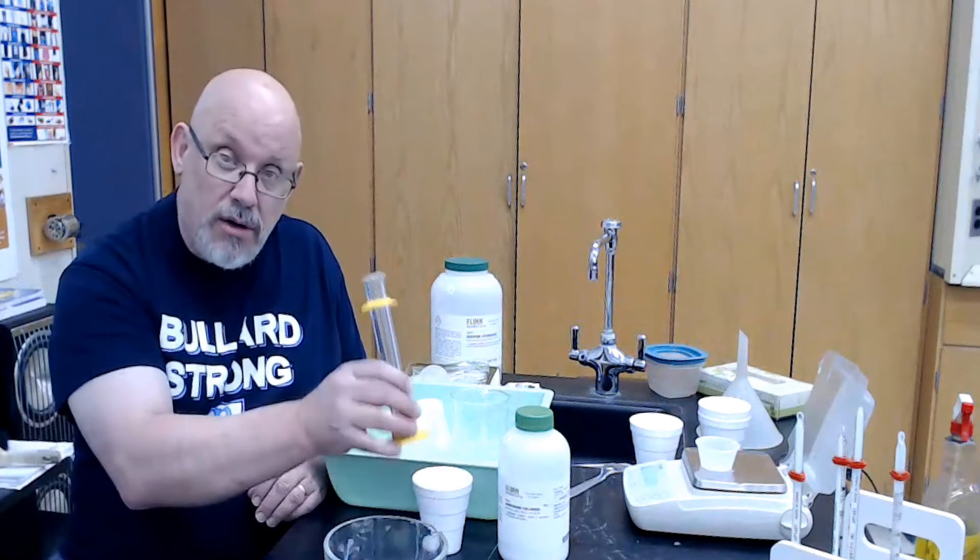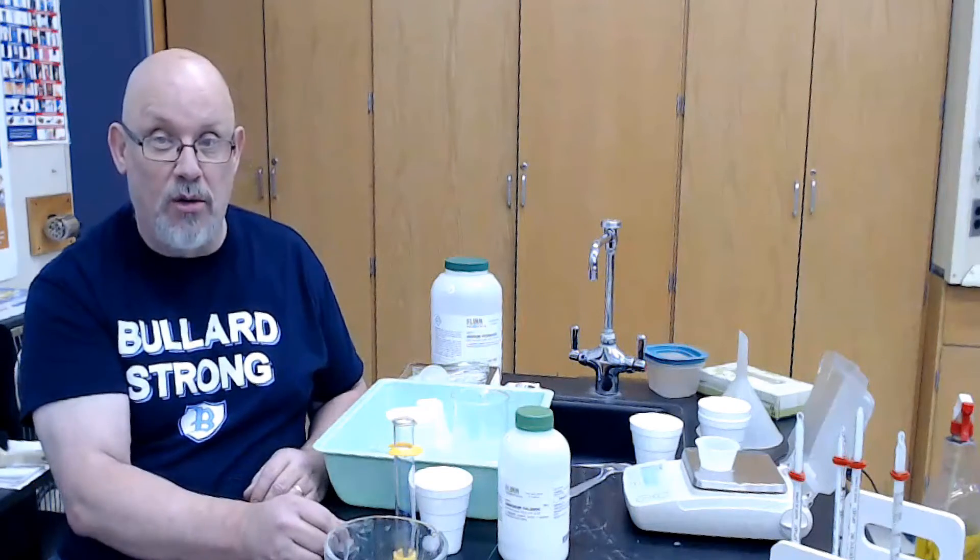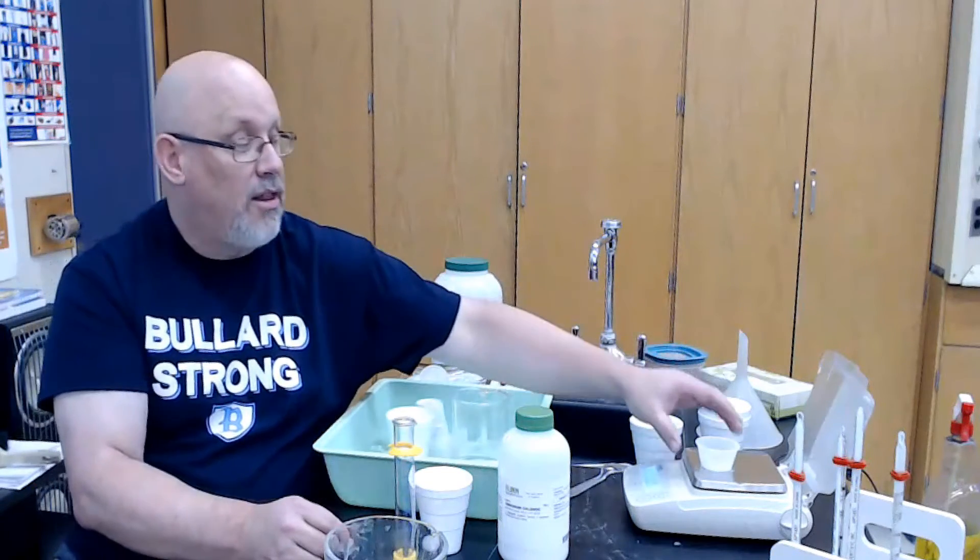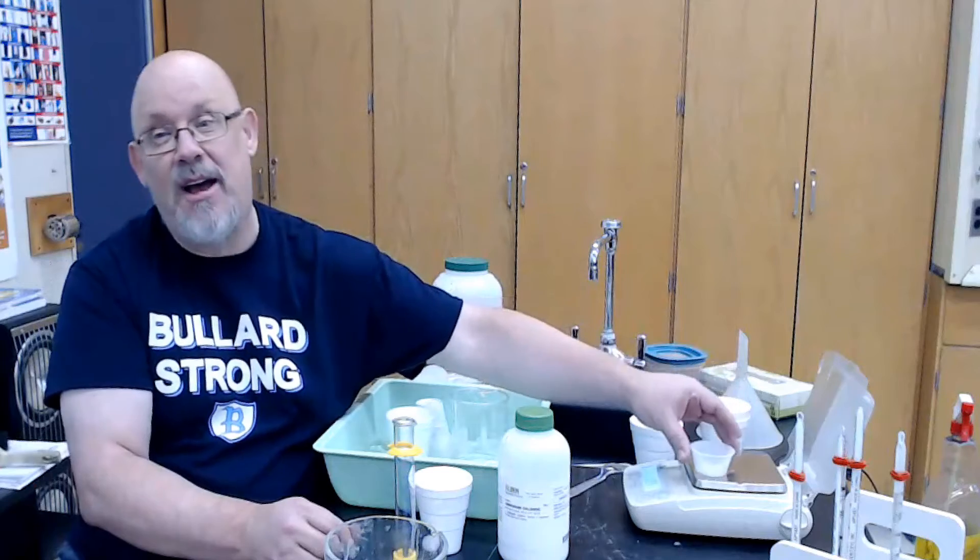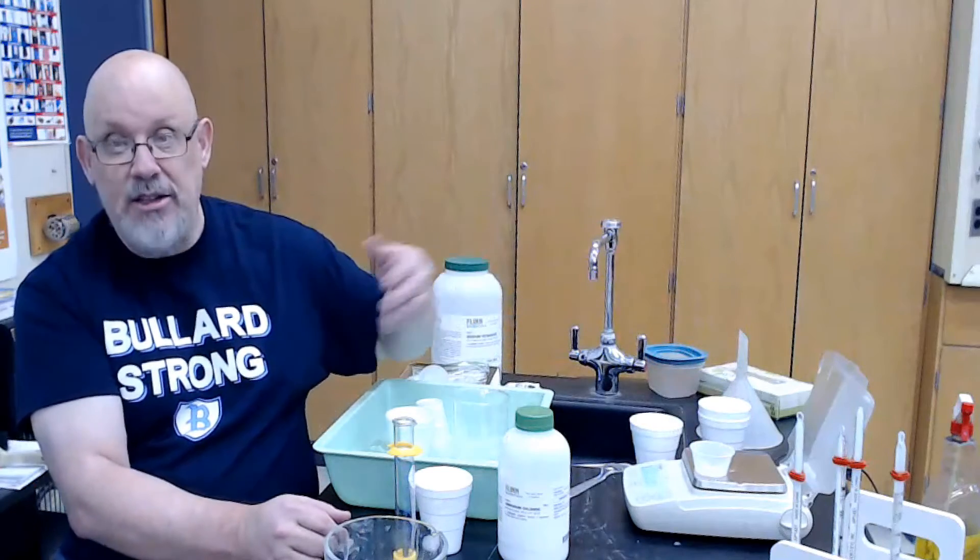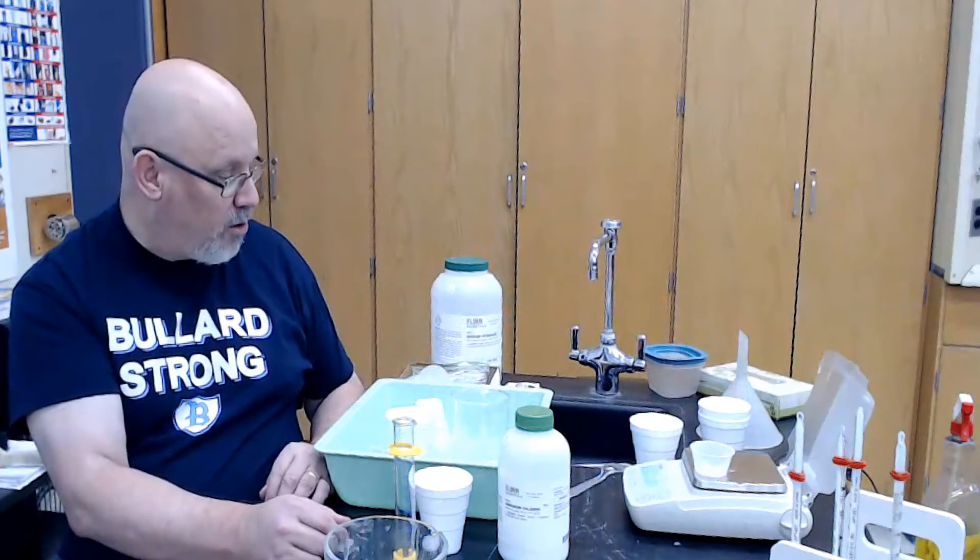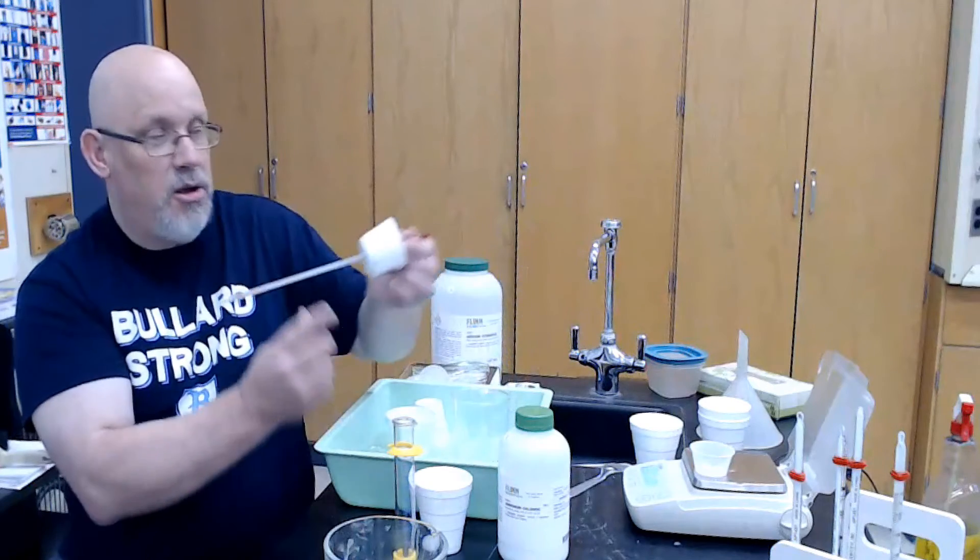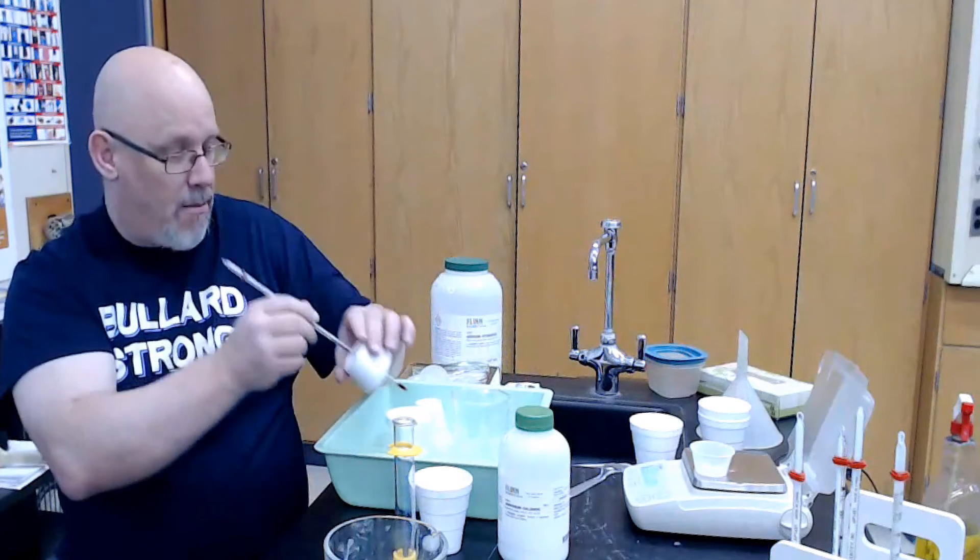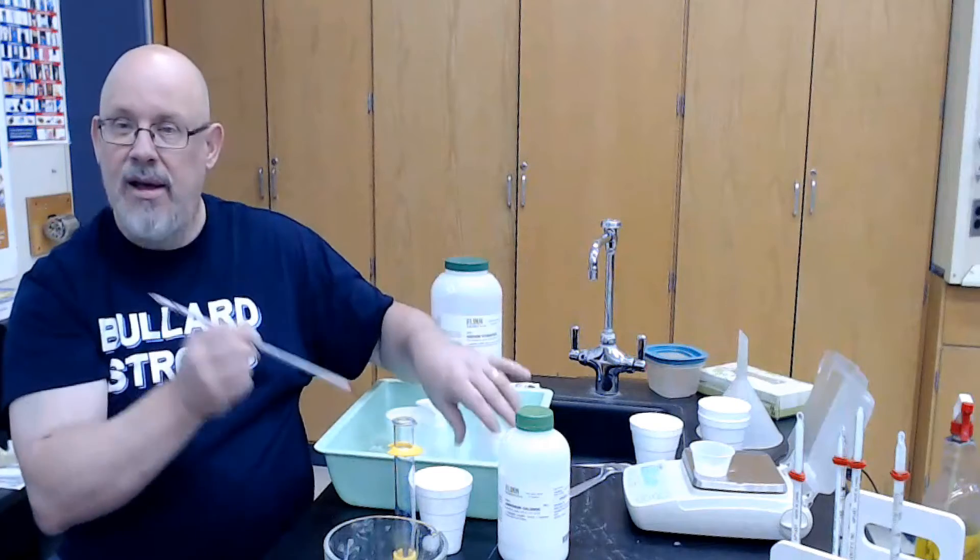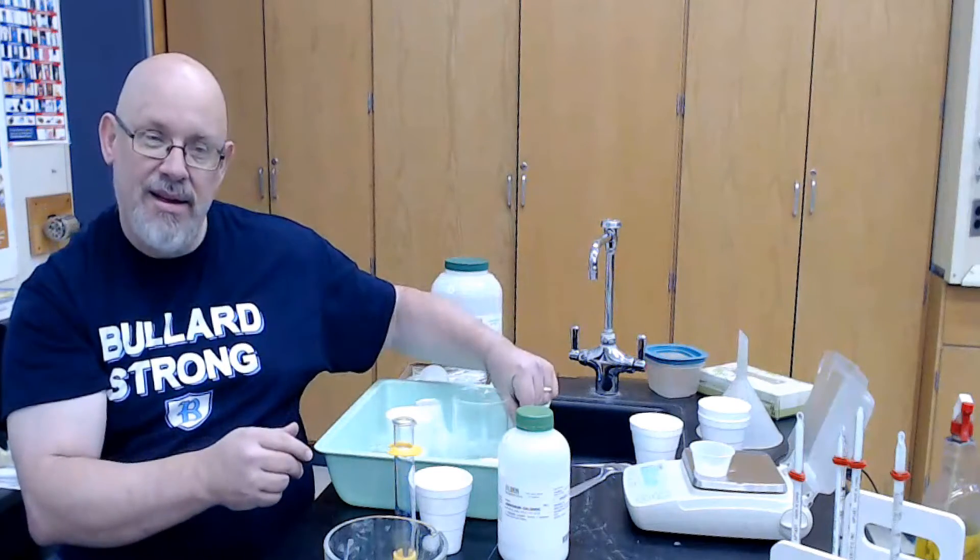So we get the mass of the water by inferring it from the volume of water, which we measure with the graduated cylinder. We get the mass of the substance that we're going to add to it by using a balance, by controlling for that. We get the temperature change by using a thermometer, which is threaded through the top of our foam cup. And that's basically all there is to it.